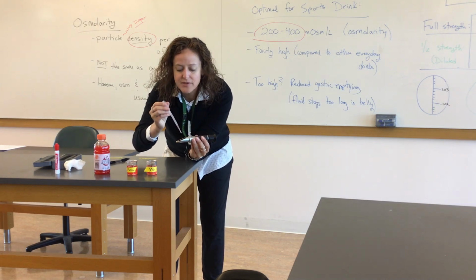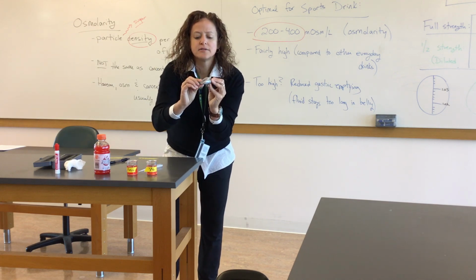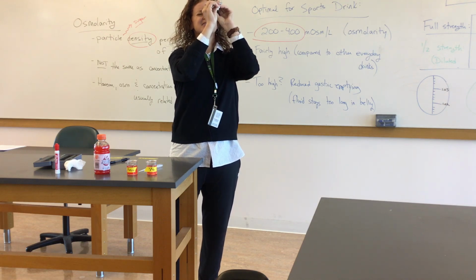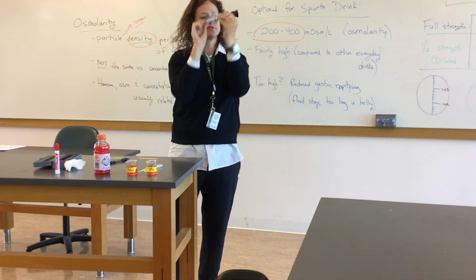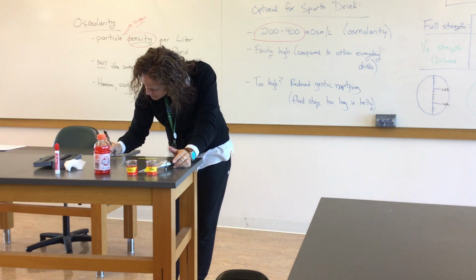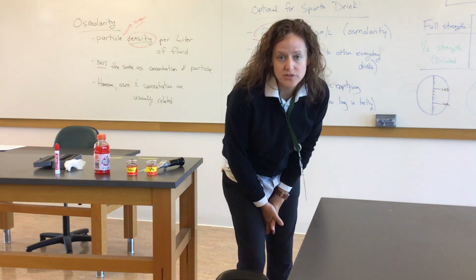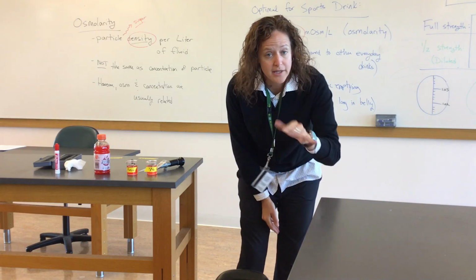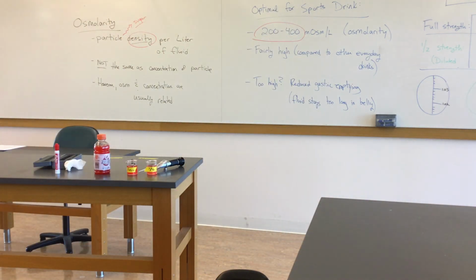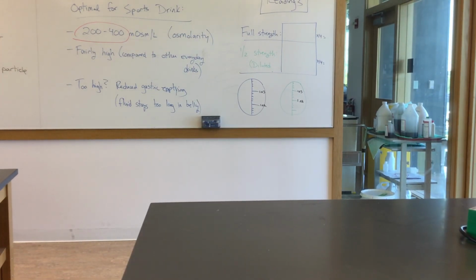So now we're going to take the diluted one and this is not going to be as dense, so the osmolarity is going to be less. So let me record what I have here. Now I'm going to turn the screen over to our results, and then you can plug in the numbers and calculate it yourself. So bear with me here. Let me go to our results over here.